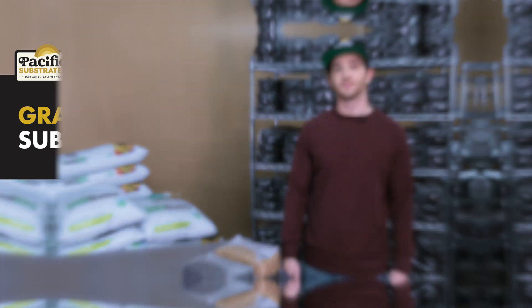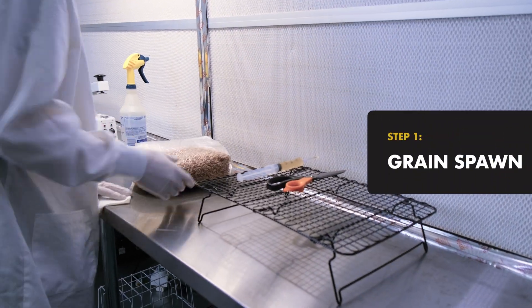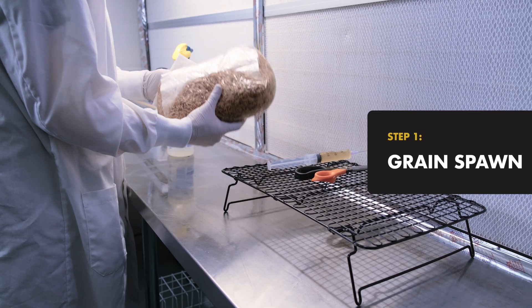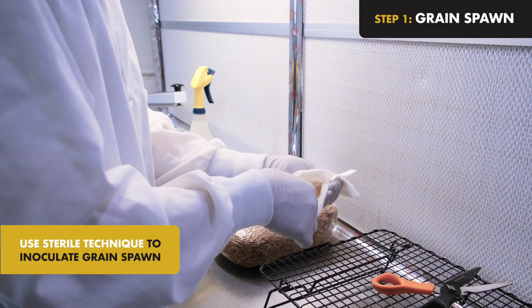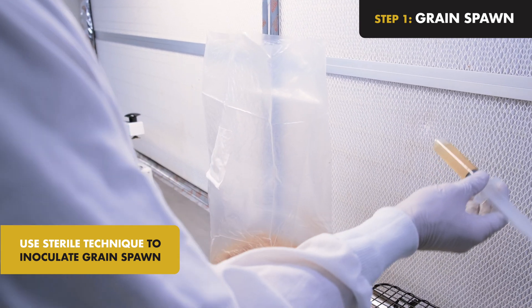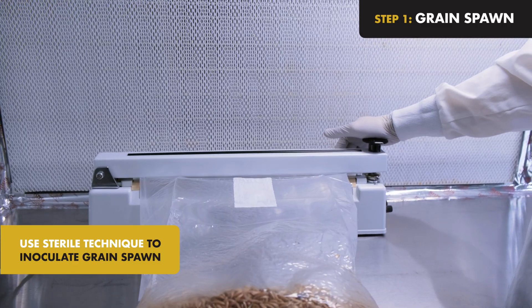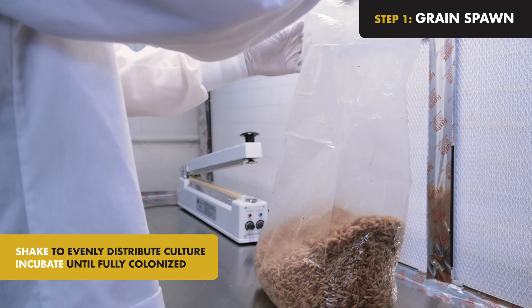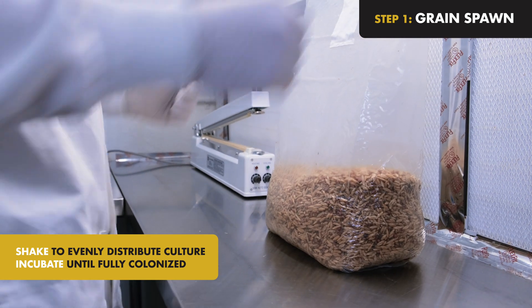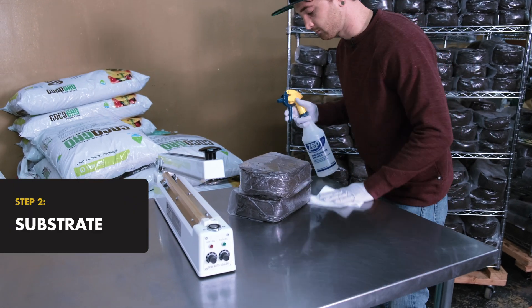Step 1: Grain Spawn. Grain spawn is used to start growing your mushroom culture. Using sterile technique, inoculate your grain spawn with 10 to 20 milliliters of mushroom liquid tissue culture and seal the bag. Shake the bag to evenly distribute the tissue culture, and then incubate until your grain is fully colonized.